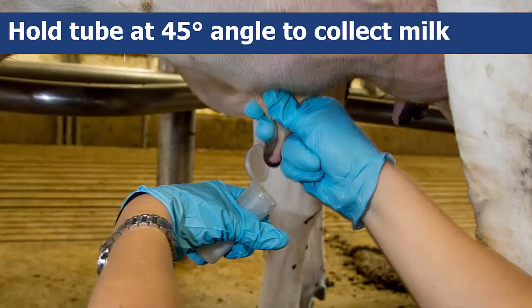Once you have cleaned the cow's teat, it's time to take the milk samples. Remove the tube cap, but do not set it down or touch the inside of the tube or cap. Hold the tube at a 45 degree angle to reduce the chance of contamination while collecting the sample.